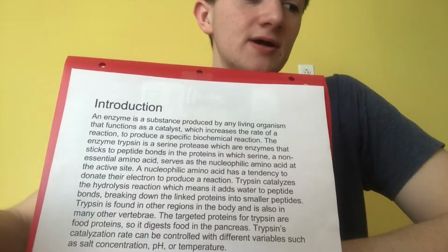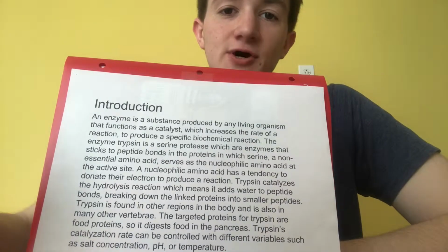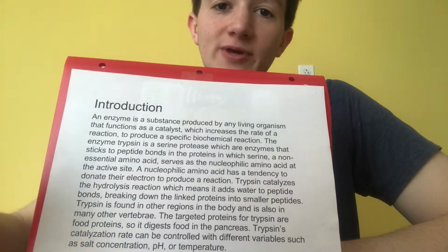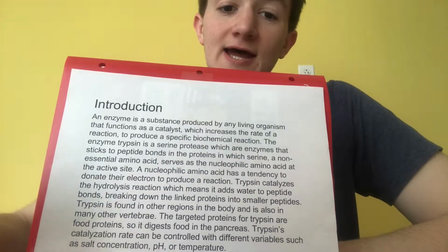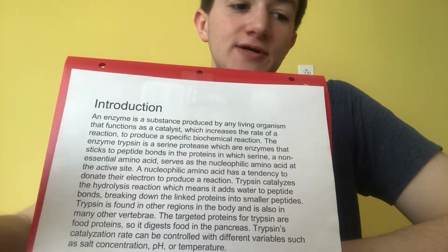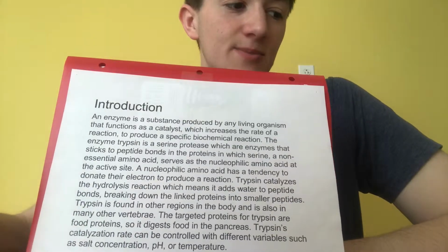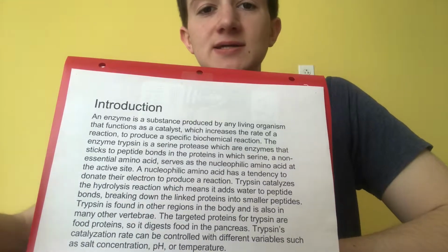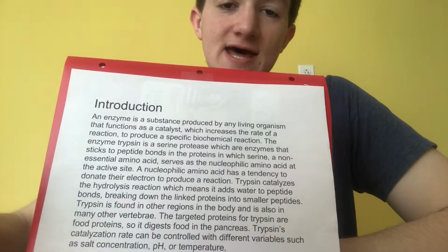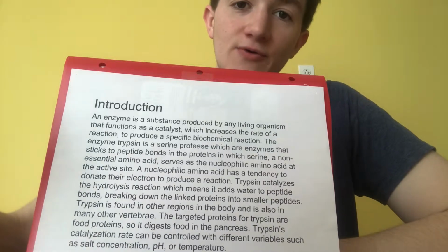In our experiment, the question was, how will changing the pH affect the activity of trypsin on azocasein? Our hypothesis was the optimum level of pH would be around 8 or 9, and any pH higher or lower than that would decrease the activity of trypsin on the azocasein. The reason we picked this hypothesis was because the small intestine pH is around 8, so we hypothesized that the highest activity of trypsin would be around 8 or 9.